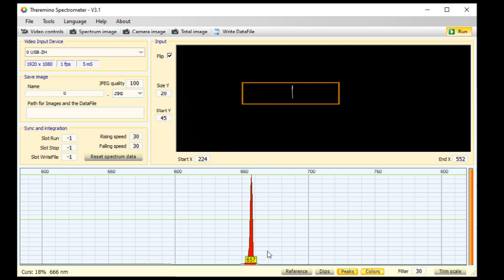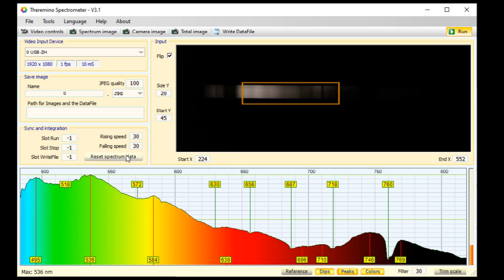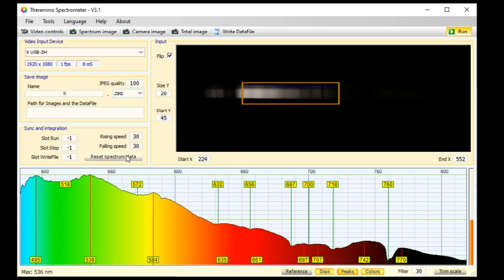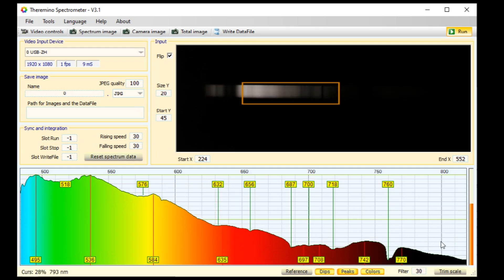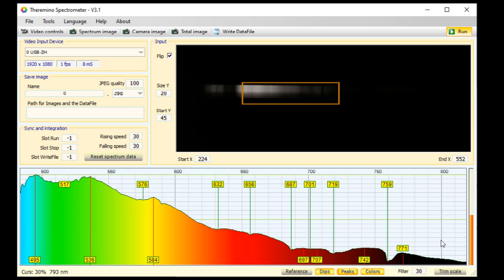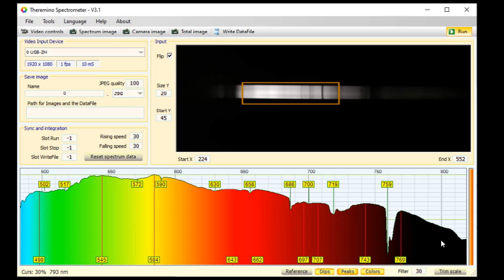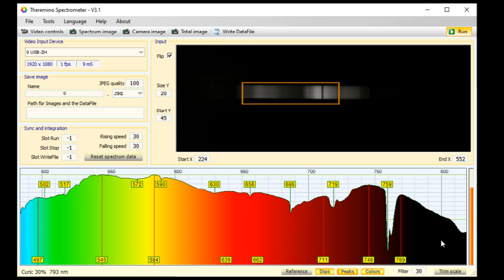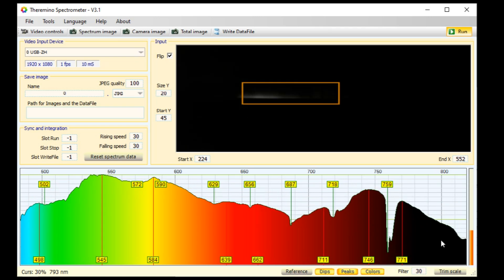Just for fun, I switch back to dips and point the spectrometer out the window again, and the H-alpha is still at 656 nanometers. So that's it — have fun with it. Remember this black area is beyond human vision. Try putting a colored gel in front of the detector, or look at other YouTube videos of people playing with spectrometers. There are hundreds of experiments you can do, such as looking at the phosphors on your cell phone, various types of light bulbs, a flame, a glowing hot metal stove, a halogen bulb, the infrared light from a remote, or even grabbing the spectrum from a carbon star through your telescope.